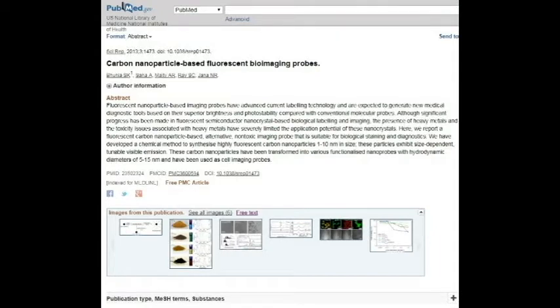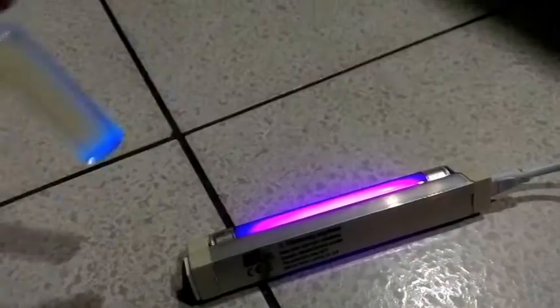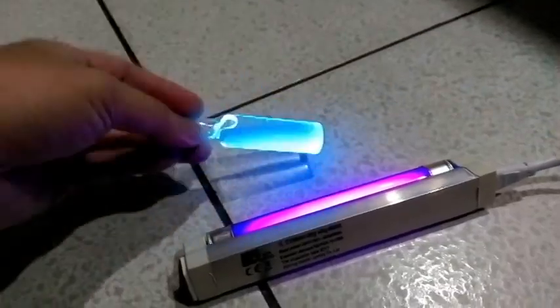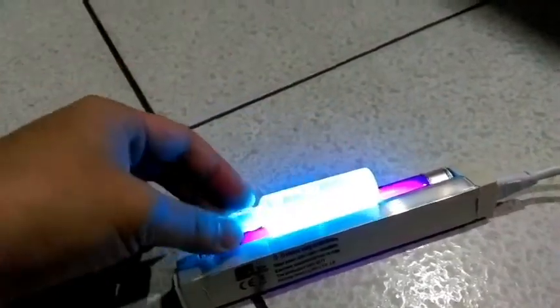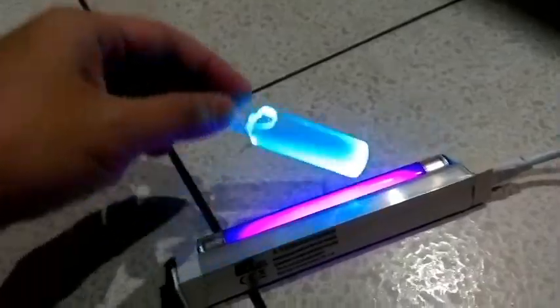Inspired by the Thought Emporium's video and the paper on nature, carbon quantum dots can be made by dehydration of carbohydrates such as sugar. I'm wondering if sugar snake could work, and it really succeeded. The intensity of fluorescence is also very impressive, much stronger than other quantum dots made from sugar.